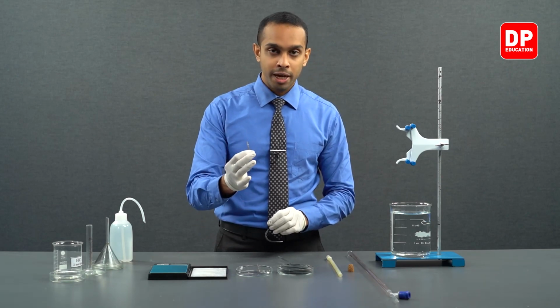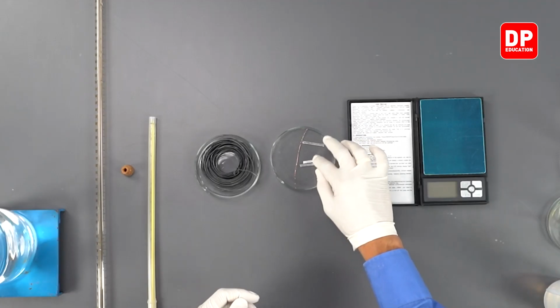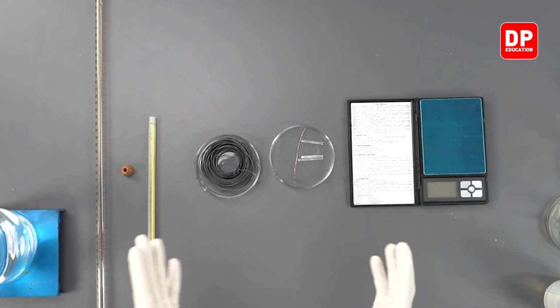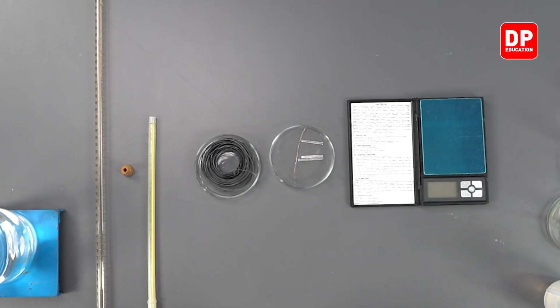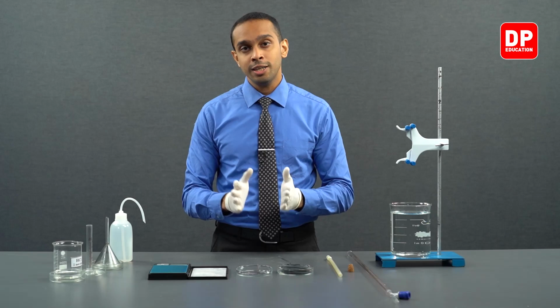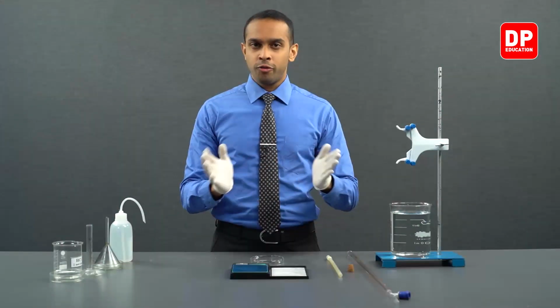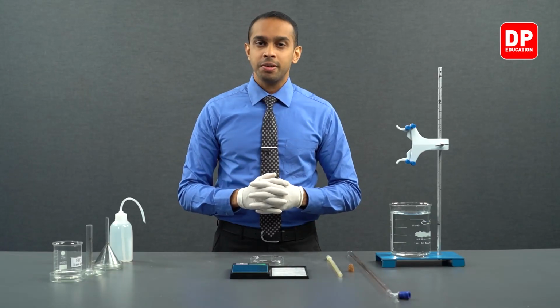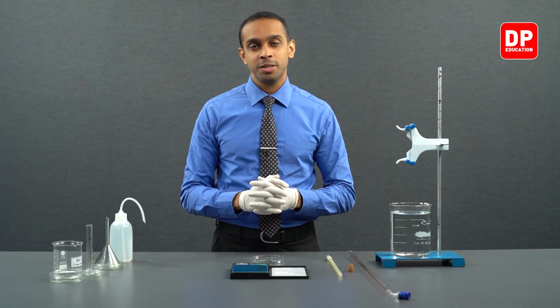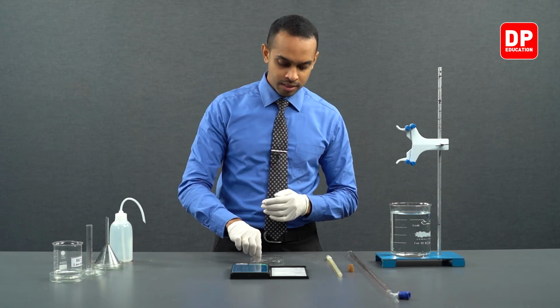Now, we have prepared these magnesium strips so that the mass of each of these magnesium strips is 0.05 grams. And in our next step, we are going to measure these magnesium strips again to see if we have the correct mass.